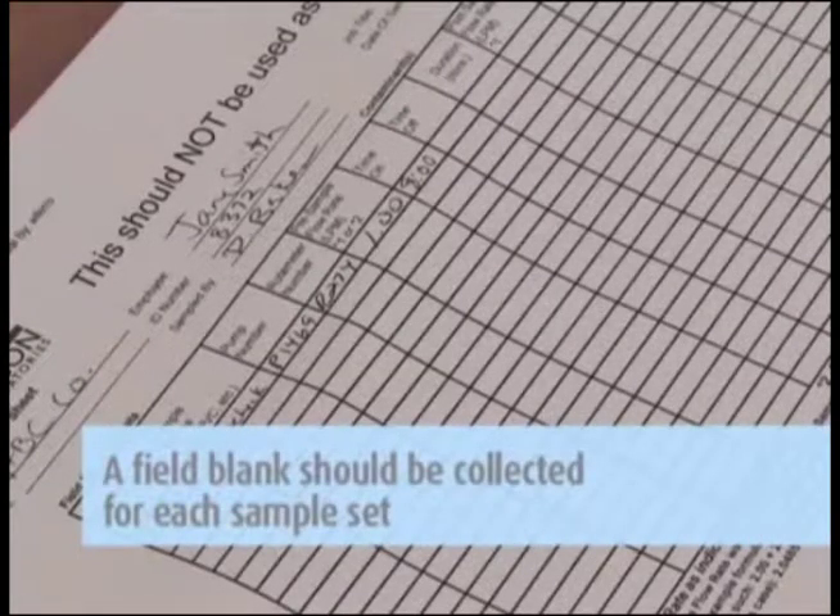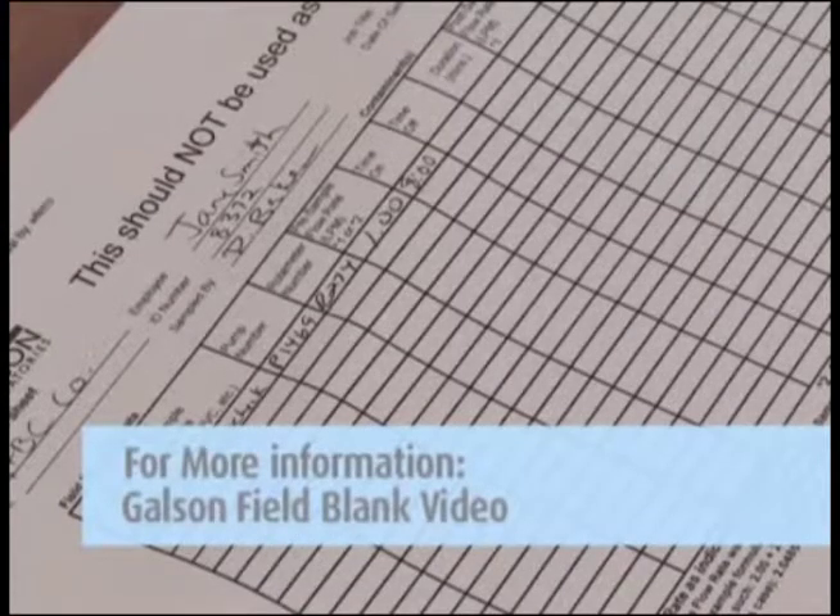The counter records the minutes the pump is operating and should read zero when you start the test. Remember, a field blank cassette should be collected for each sample set and should accompany the actual sampling cassettes during all periods except actual sampling. For more detailed information, watch our field blanks video.